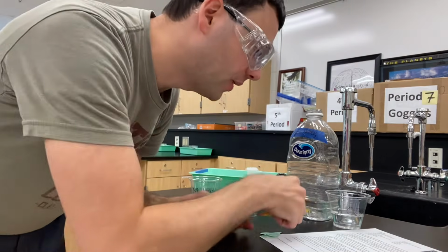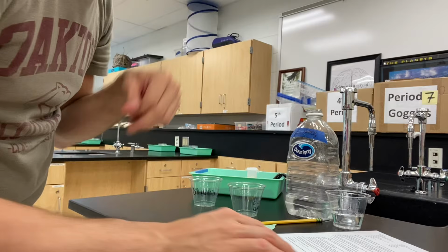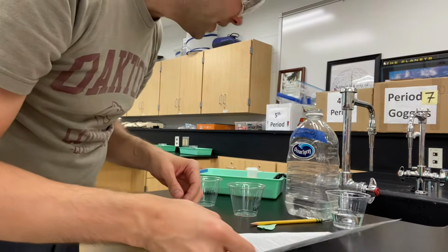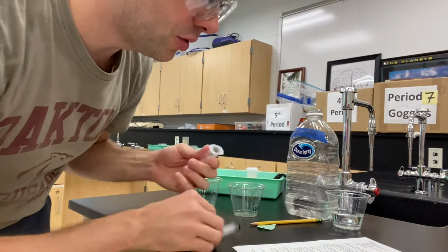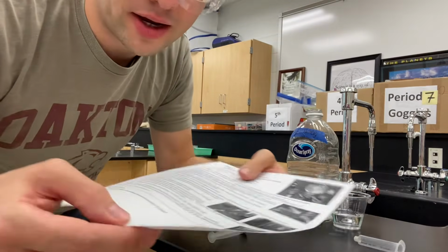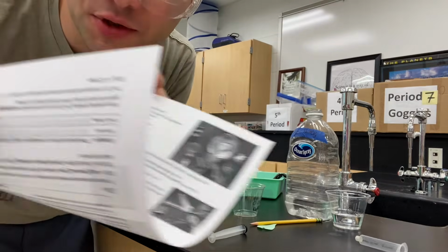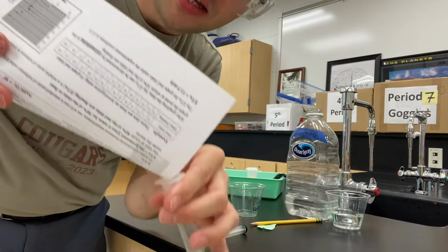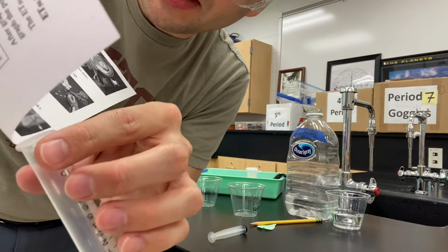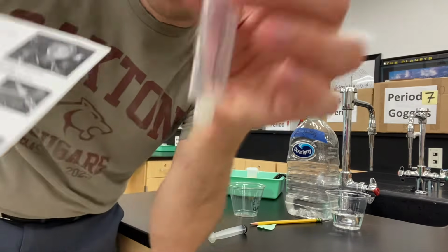All right, after you do that, step 4 is to take one of your syringes. I would recommend hot dog folding the piece of paper that has the hole punches on it and emptying your little discs into the container.